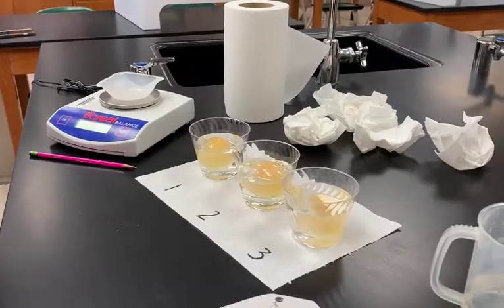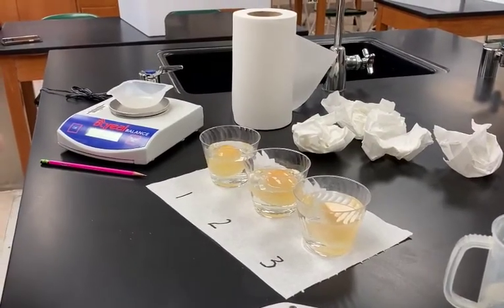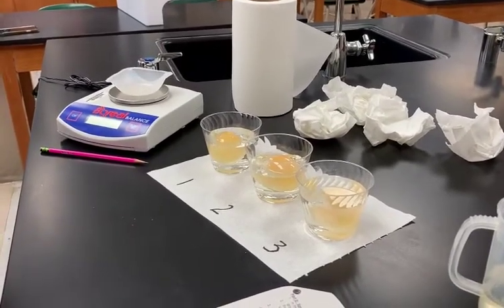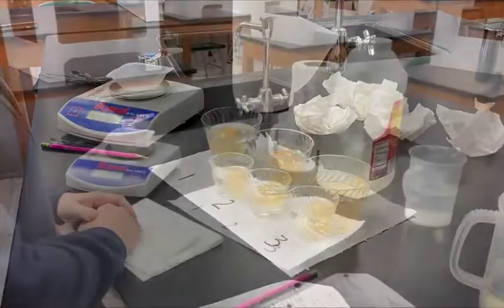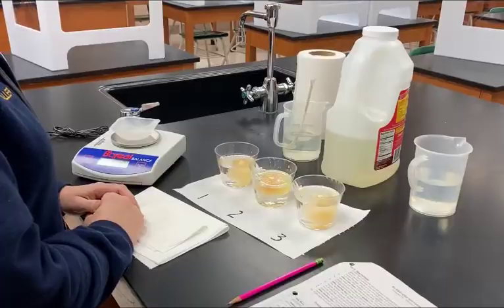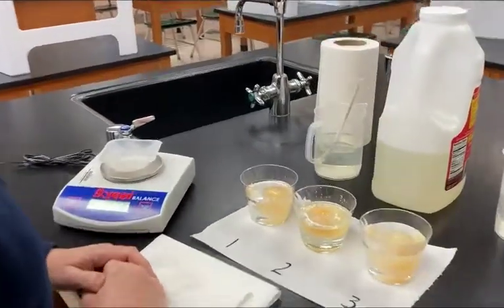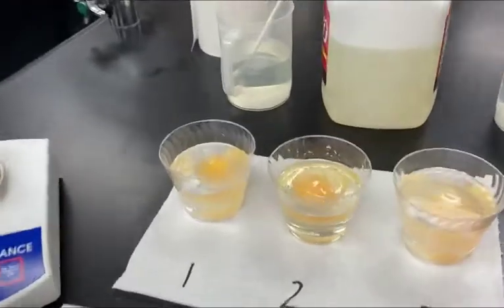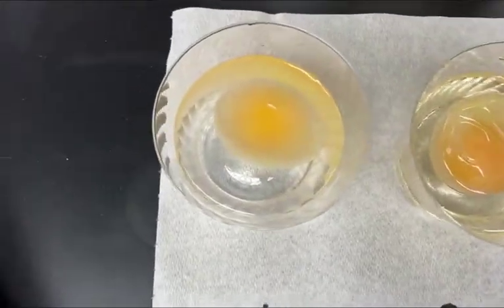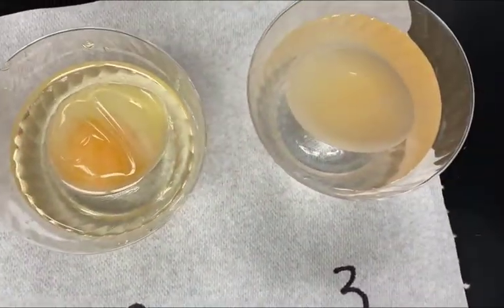One of the solutions is going to be isotonic, one of them is going to be hypertonic, and the other one is going to be hypotonic. Based on their mass and how the mass changes, we should be able to tell which one's which. It's been several hours — we put the eggs in their solutions early in the morning and it's now the afternoon, which is enough time. If I come over here and look at eggs one, two, and three, hopefully you can see that some changes have occurred.